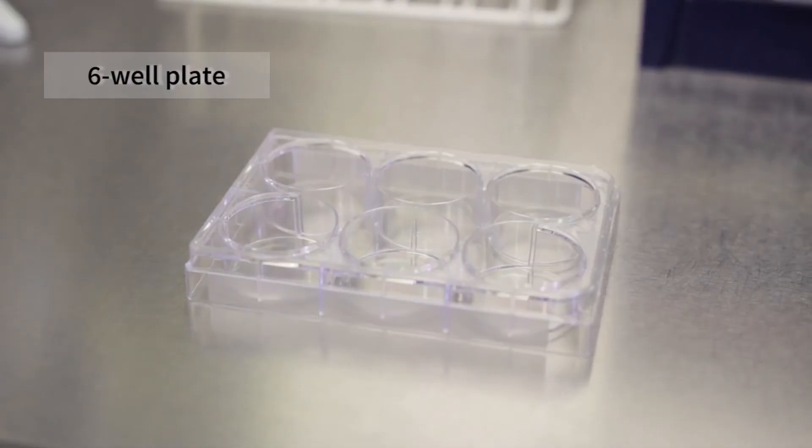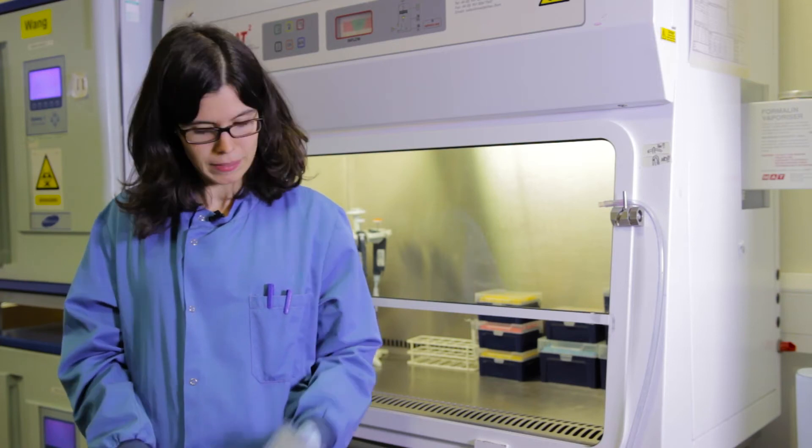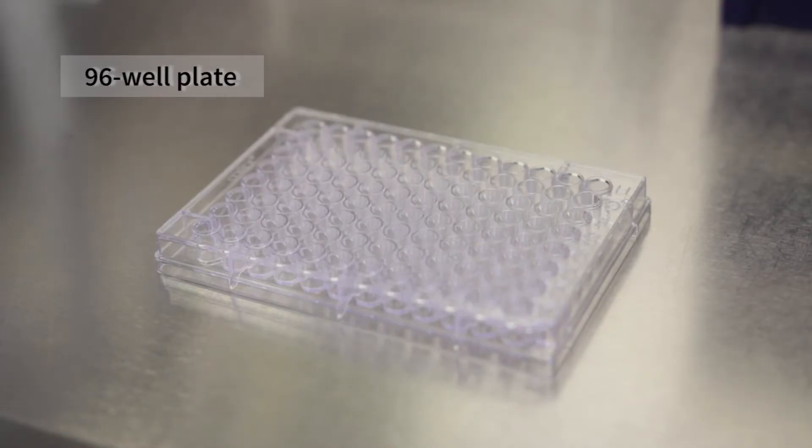The way we seed the cells depends on the type of assay we want to perform. This is a six-well plate. We use it to grow cells for preparing samples for western blot, for example. This is a 96-well plate and it is commonly used for cell viability assay. Now I will show you how to seed cells for a cell viability assay.